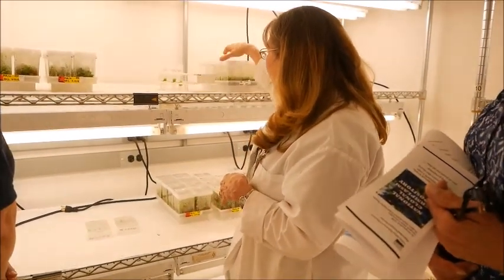You have to grow them a little bigger than that first. I'll get a box like this of them, then we'll get roots on them. Because plants growing in boxes are worthless — at some point, to be a real plant, they've got to go out into the real world. You just wash off the gel and put them in the soil. But in these environments they haven't learned to close their stomata, so the transition from here to the real world is a tricky one. I don't do that transition — we have this amazing person out in the greenhouse named Deborah, and she is able to guide these plants through in an amazing way.